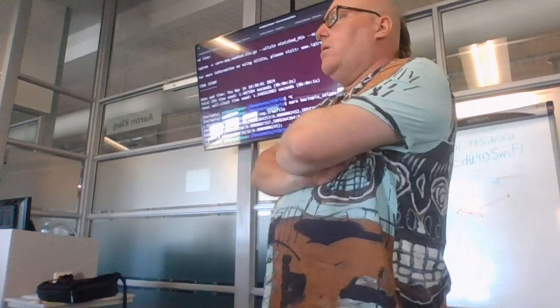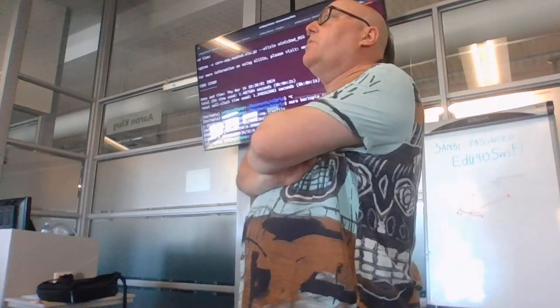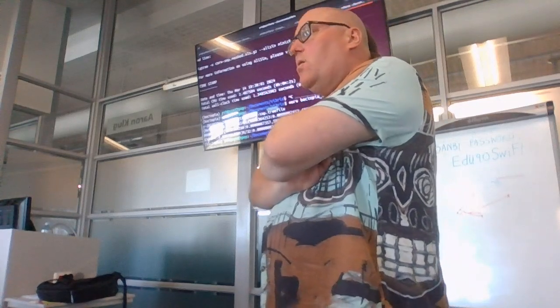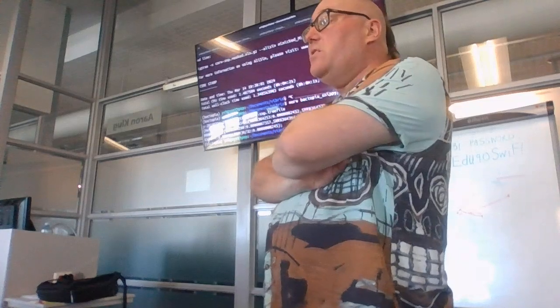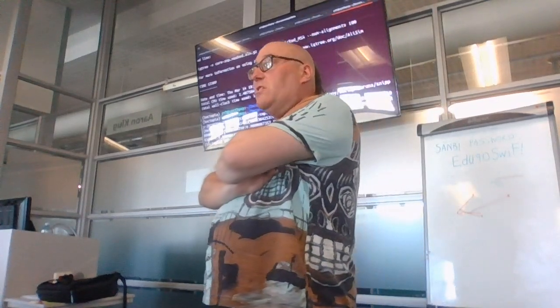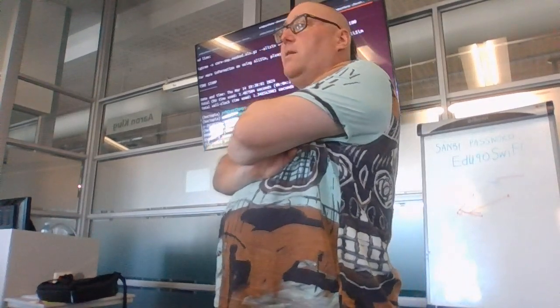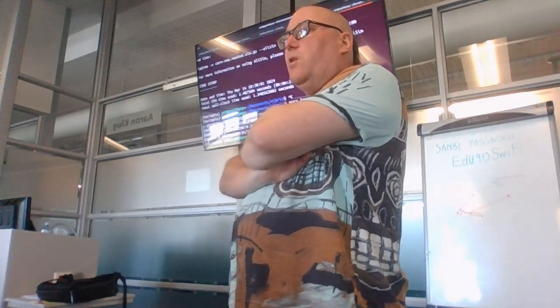It does a de novo assembly, but the thing that's very useful there is that it does what's called a sourmash sketch, where it basically tries to predict which species you're looking at based on comparison to a database called GTDB. And I found that that's very useful because if you do that and it doesn't show up as Vibrio cholerae, don't take the sample further.